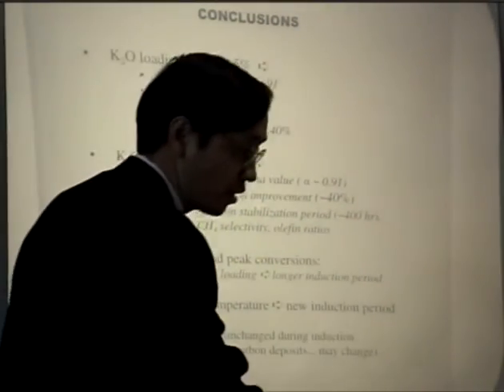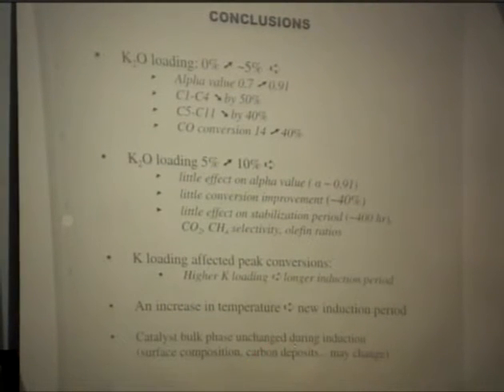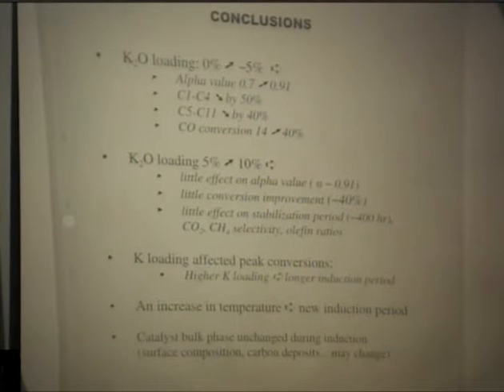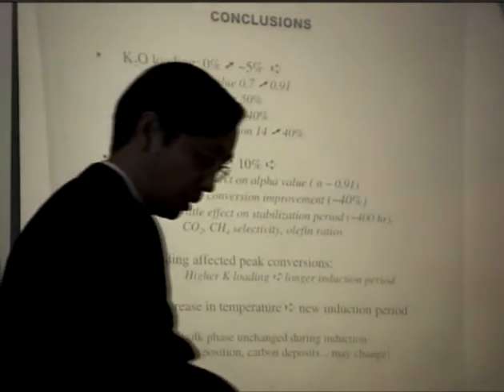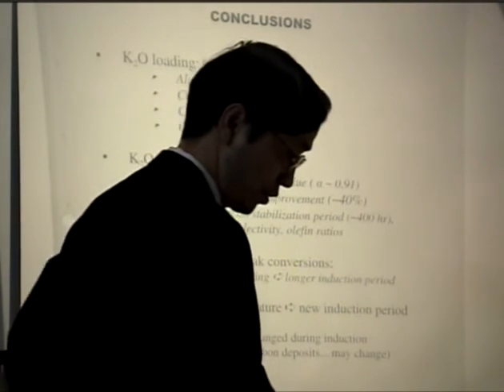From the Mössbauer results, we can see both phases of the iron catalyst did not change during the induction period. That's probably the surface composition or the surface carbon deposition that causes the change in CO conversion.